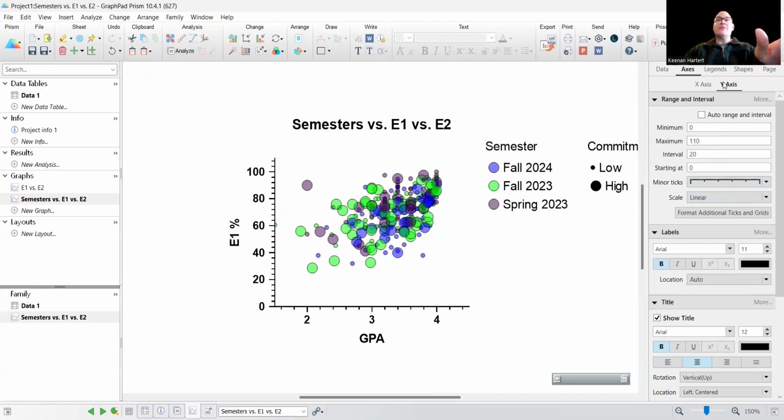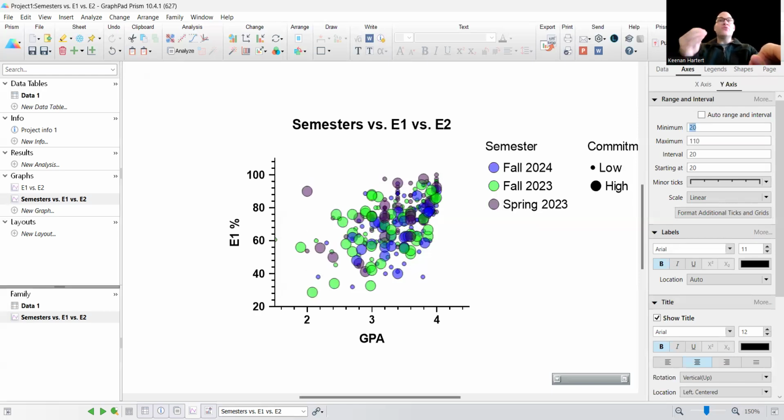So the real time capabilities of these are intense. And I just love it because it really gives me good, really quick pictures, especially when I'm trying to compare all these variables against each other. And I really do just want to see some relationships because I know, like you, I probably use Prism a lot just to say, hey, what does it look like this? What does it look like this? And that is one of the top ways we can see.